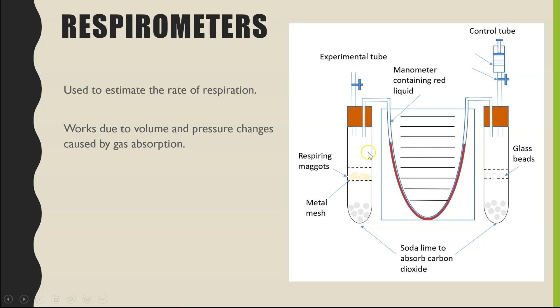Our experimental tube will have a living organism within it that will respire. Now I'm using maggots as the example today, but just as likely you could do this experiment with wood lice or sometimes with plants, in particular peas is a common example - fresh peas which should still be respiring.